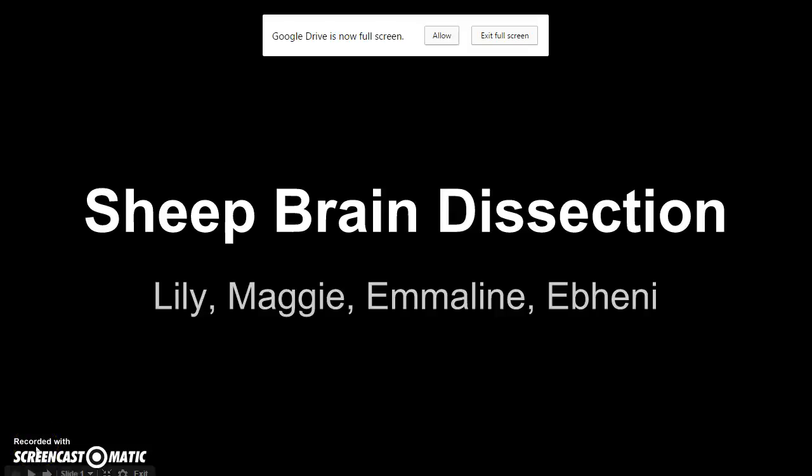Welcome to a sheep brain dissection lab, where we will be dissecting the sheep brain and locating major lobes, fissures, and various other components.